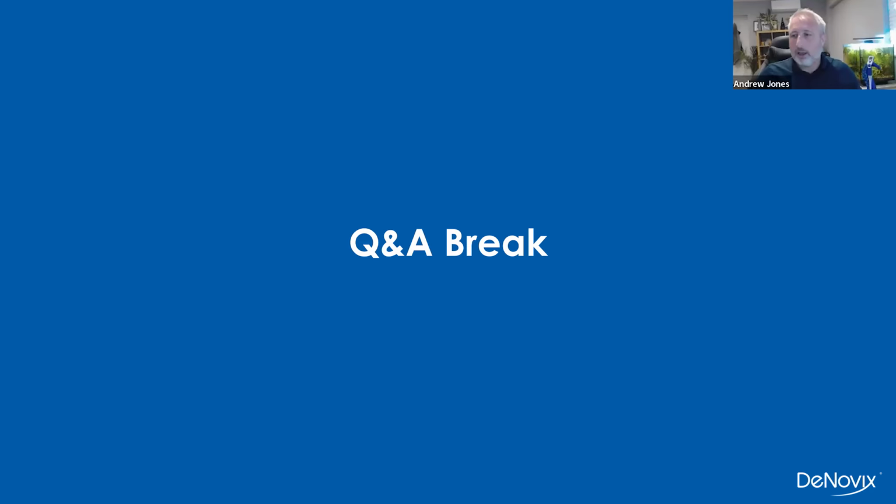Hey, Corey. Okay, great. Thanks. So we've got a couple of questions that have come in already. If you do have more questions, as I mentioned, put them into the Q&A box and we'll pick them up as we go along. Just a couple of questions.